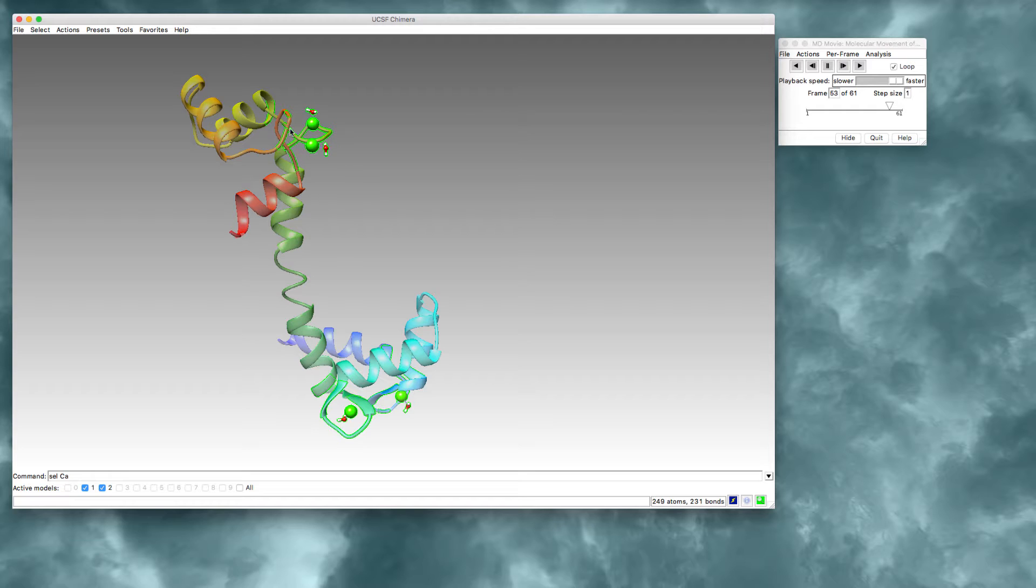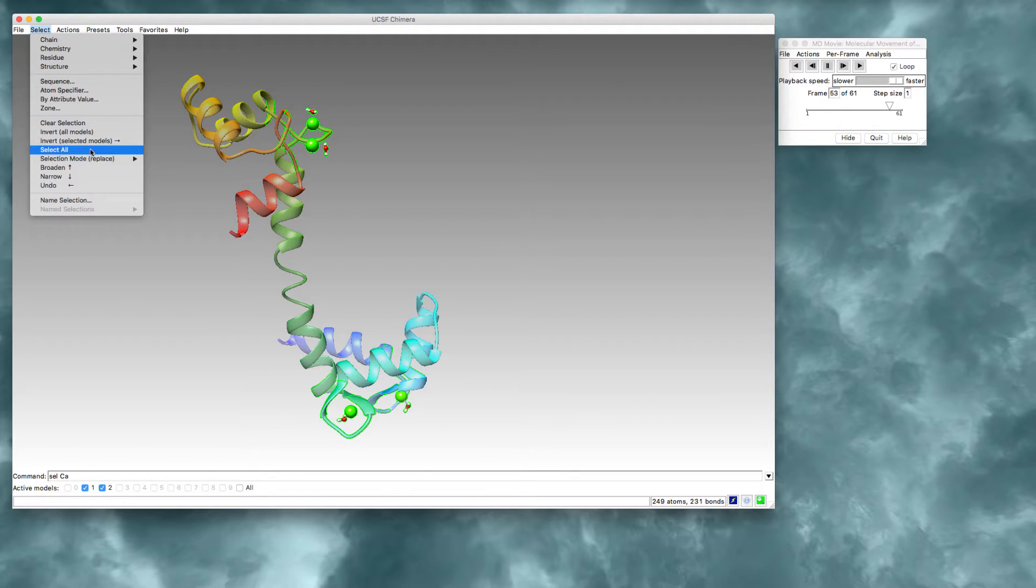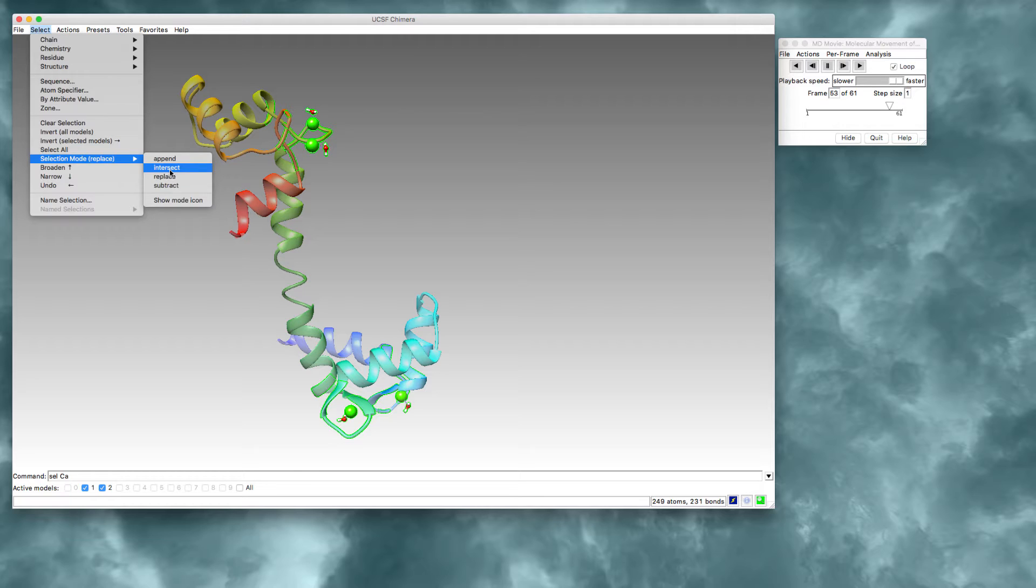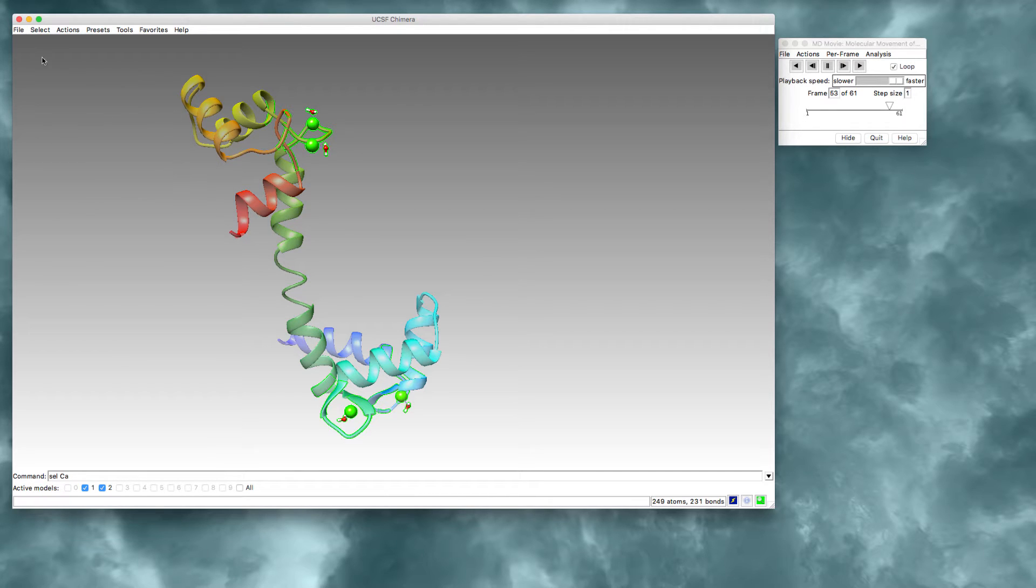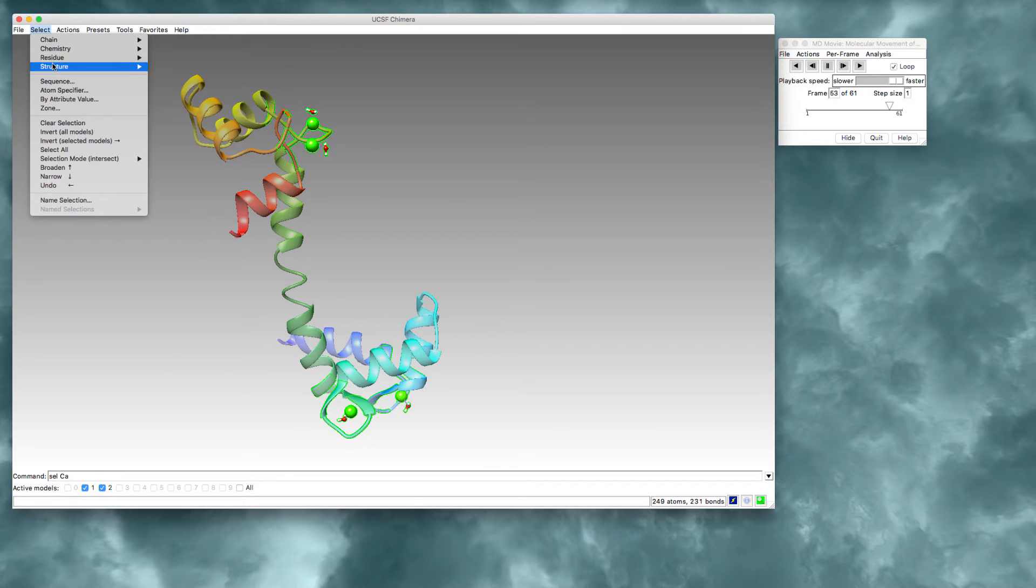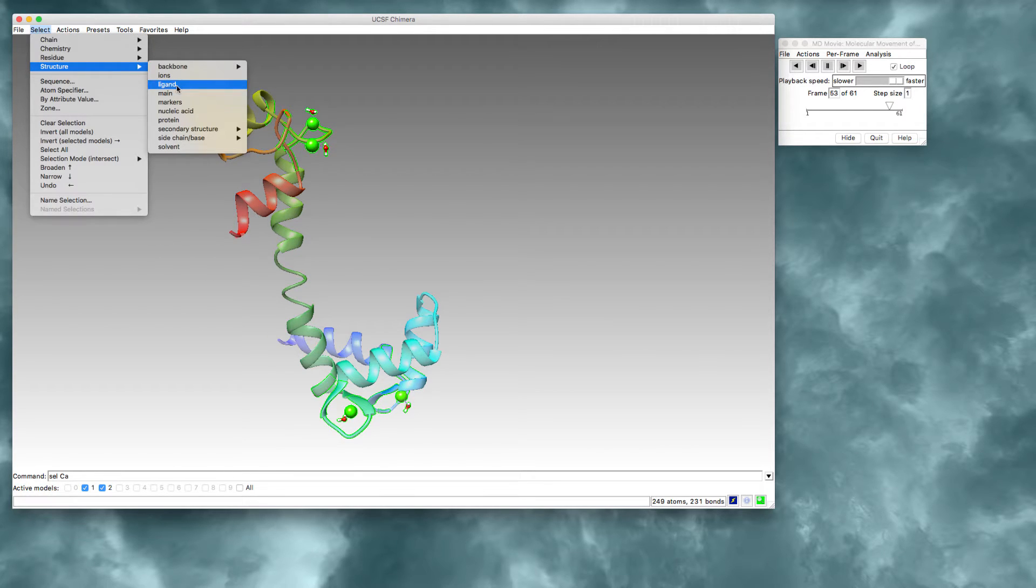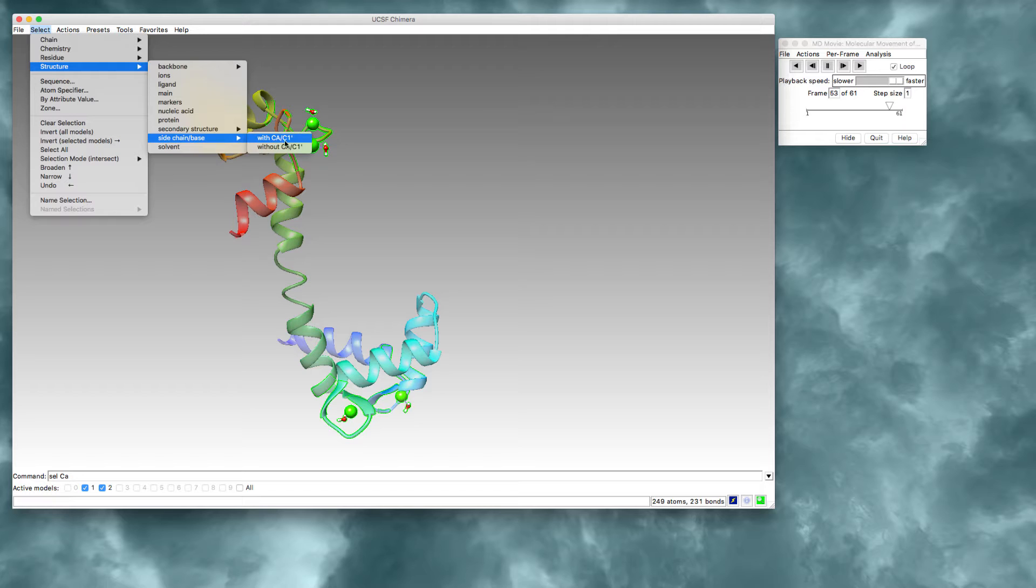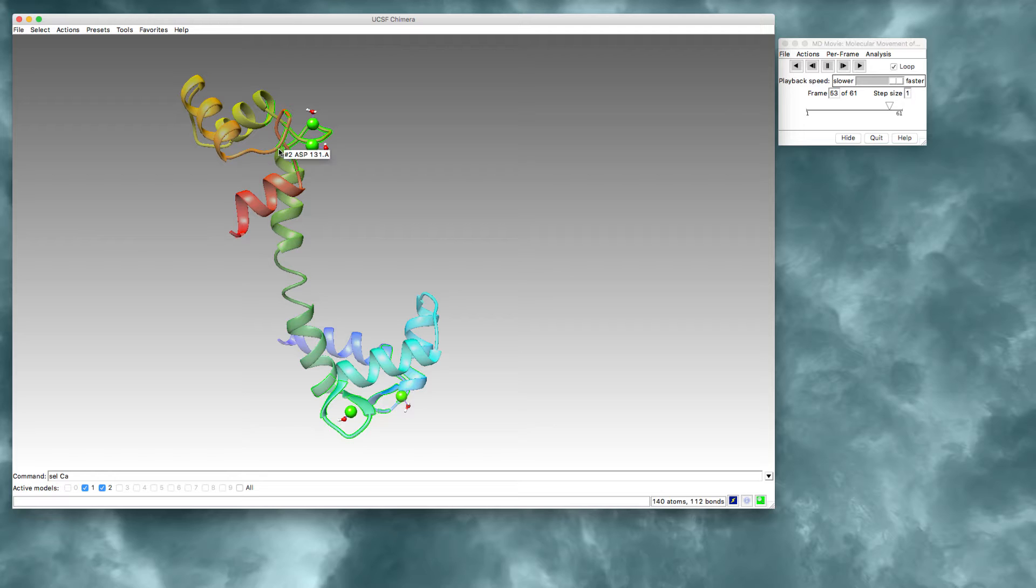So now I'm going to change my selection mode again to intersect. And I'm going to select, of the zones that are already selected, I'd like to select the side chains. And I will choose selecting with the alpha carbon. And now I'm going to ask it to show the atoms and bonds of those side chains.